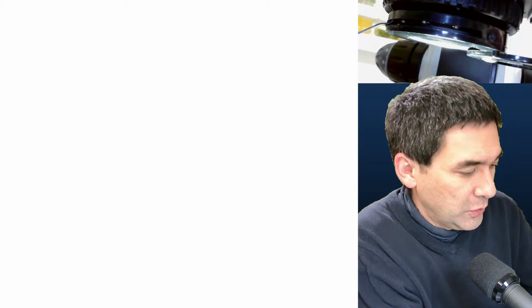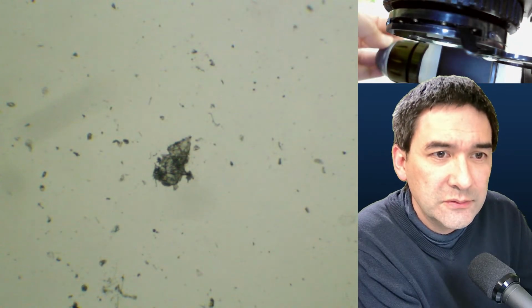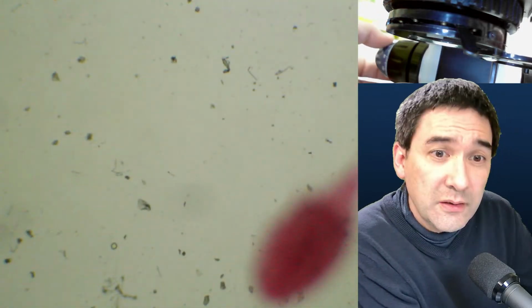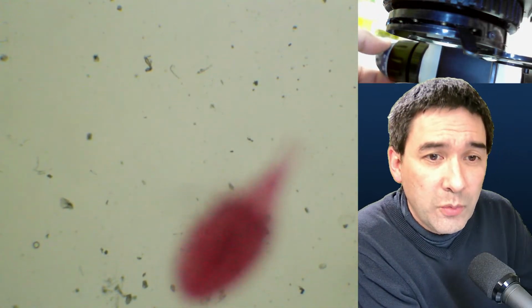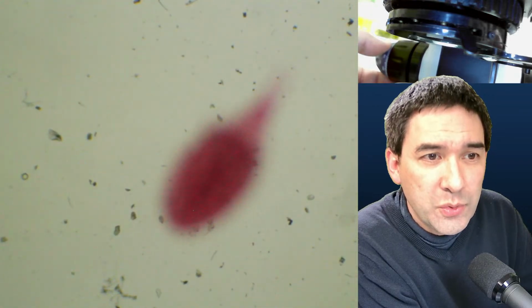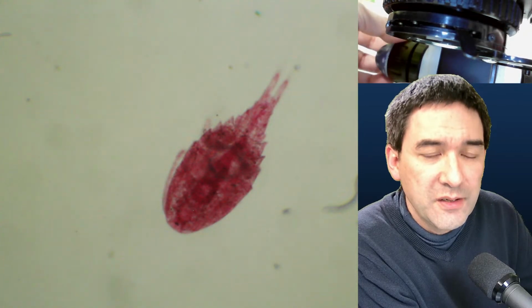Yeah, everything is a little overexposed now again. Okay, I have to maybe just find it here using my low power, and maybe I have to see where it is. No, that's not one. For easier focus, I'm going to close the condenser. Okay. I have to find it, just a second. Here is one, okay? So these are water crustaceans. It's a permanently mounted commercial slide. The specimens were stained, okay? So, yeah, it's basically some water fleas, right?